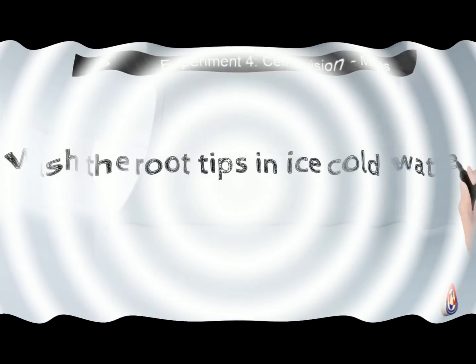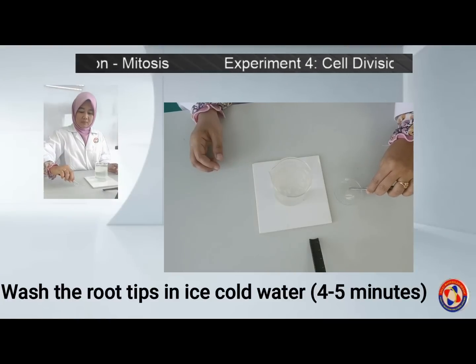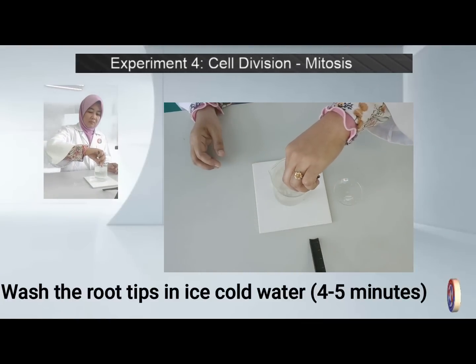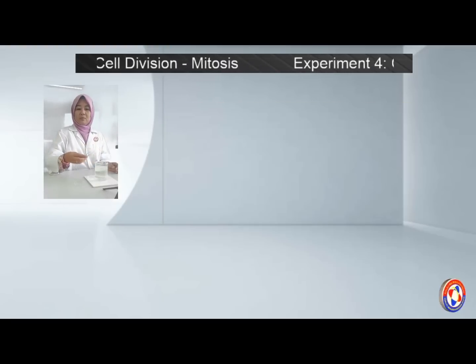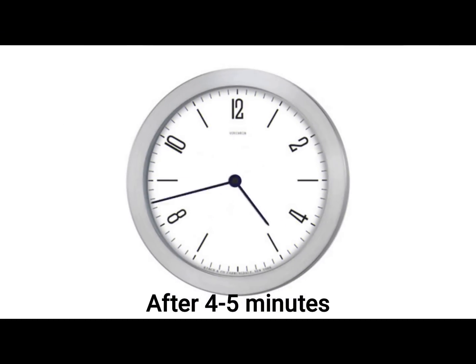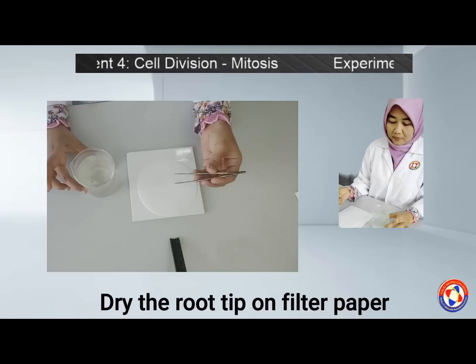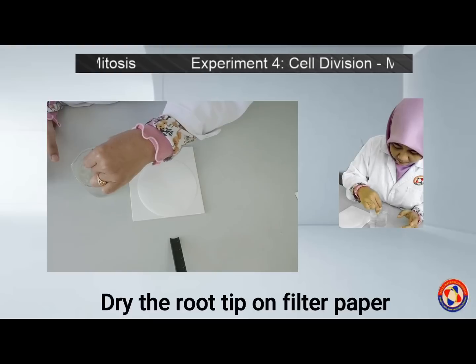Number three, wash the root tips in ice cold water for 4–5 minutes. Make sure the ice cold water you prepared has a higher volume of water compared to the ice, as this will help in the next procedure. After 4–5 minutes, take out the root tips and let them dry on the filter paper.